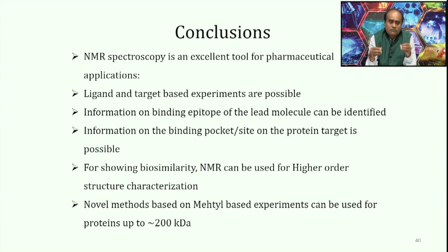Today what I showed is a robust tool for demonstrating the biosimilarity, higher order structural characterization, and not only small peptide based drugs. Really we can use NMR spectroscopy for a bigger biodrug up to 200 kilodalton and do a robust biosimilarity analysis in this case as well.